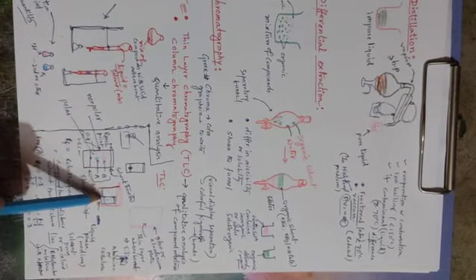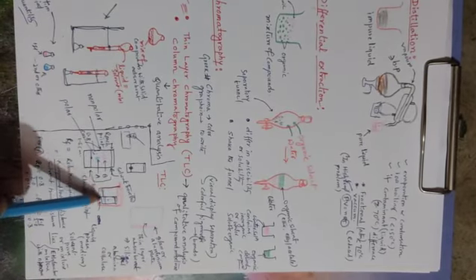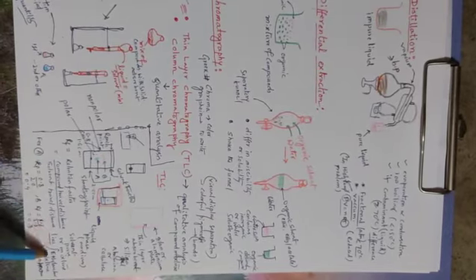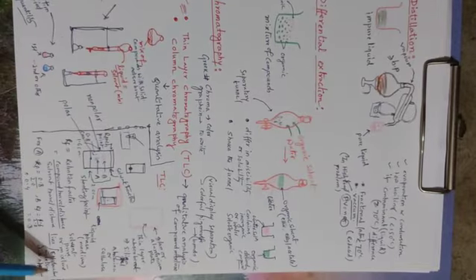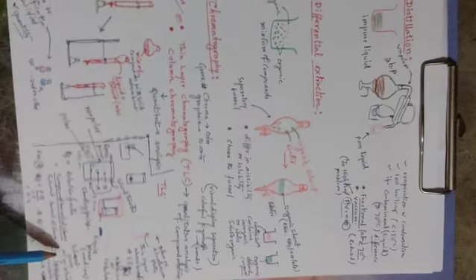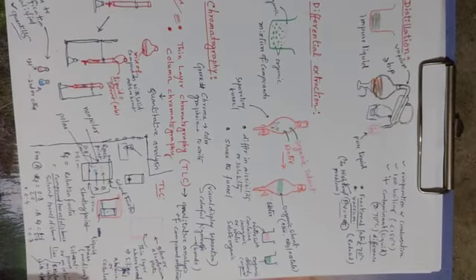This solvent or medium, whatever is used here as the mobile phase, will be either a pure solvent or a mixture of solvents. In common cases, an ethyl acetate and n-hexane mixture is used. Other solvents are also used in other cases.